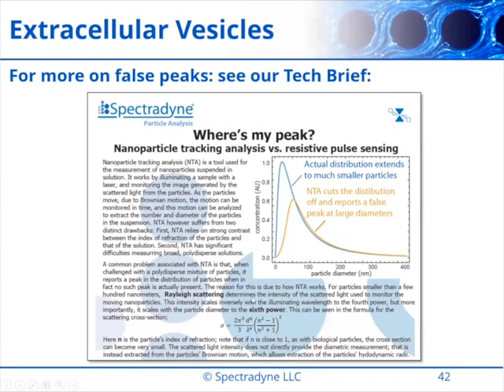But basically what we did is we mocked up a distribution, shown here in blue, of a mock nanoparticle formulation. And then we simulated what NTA might measure based on the fact that the light scattering intensity varies as the 6th power of the particle size, shown in this formula here. So it's a relatively simple convolution to do. And if you do that, you see that this blue distribution gets transformed into this orangish one here.